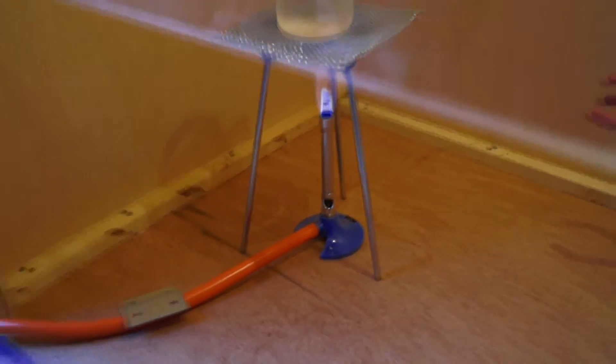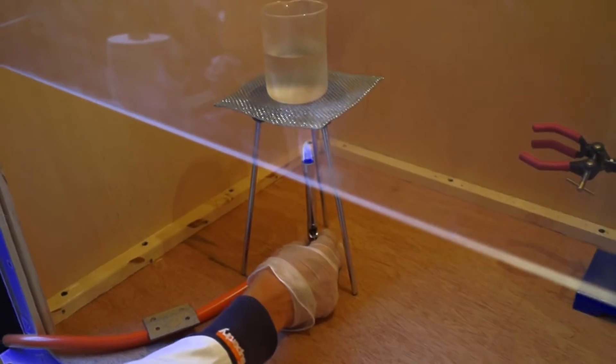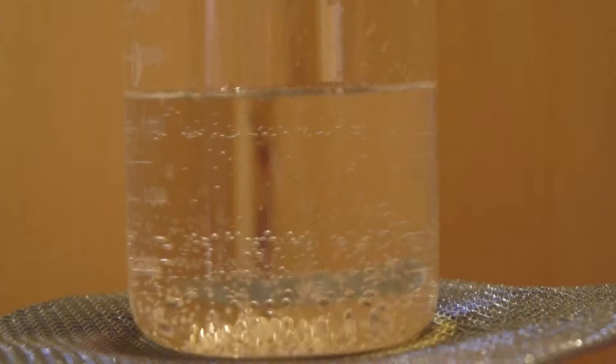You should then boil the remaining solution down to about 40-50ml to create a supersaturated solution of sodium acetate. This takes quite a while so you must be patient.